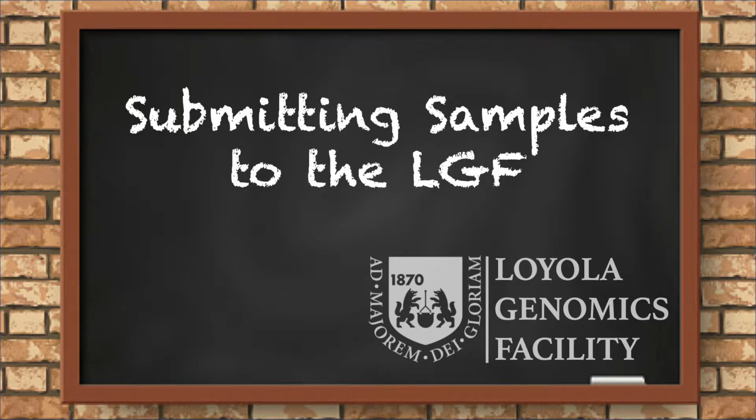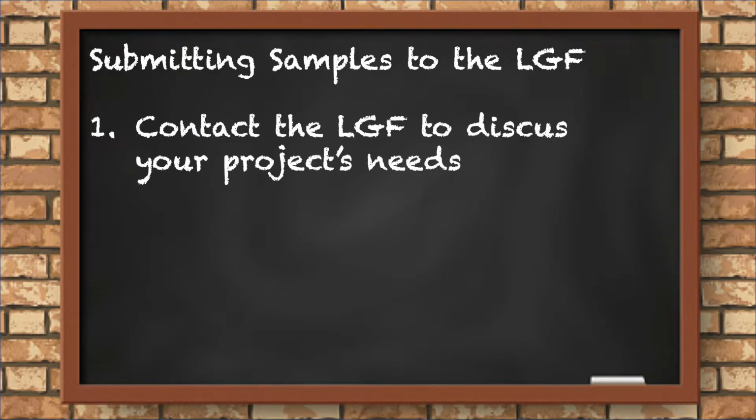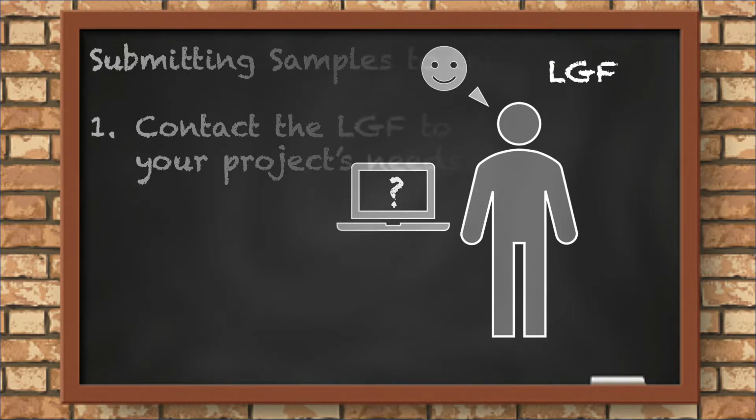At the LGF, we know that your sequencing samples can represent considerable time, effort, and expense. To get the best, most relevant sequencing data for your samples, we recommend the following steps for interacting with the LGF. First, it's always a good idea to contact the LGF to make sure that you're getting the most relevant LGF solution and the most appropriate sequencing depth for your experimental design.